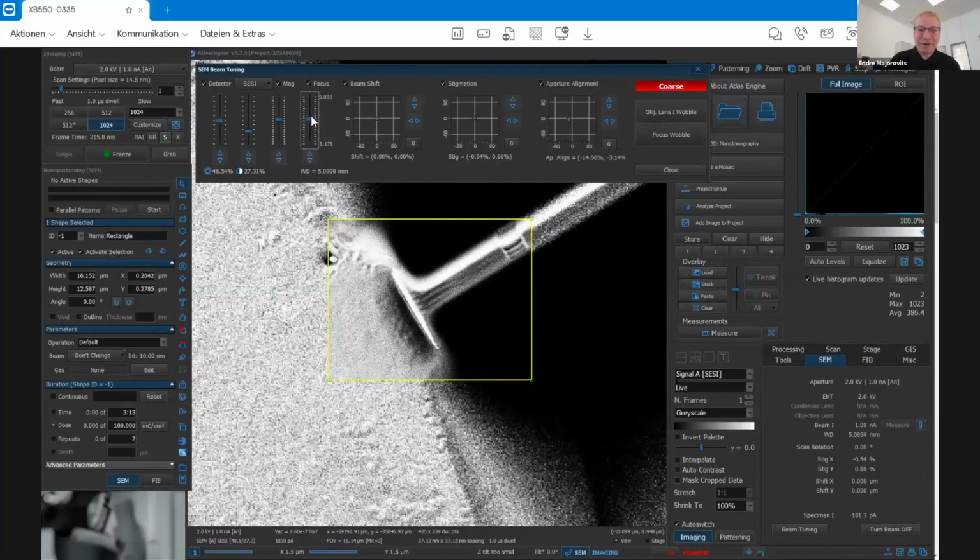And another thing that I haven't mentioned before in SmartSEM, but I will mention it now here. There is a focus wobble. This is used for the aperture alignment. So in case I need to do some alignment here. Okay, so now you see it got worse. So I go a few steps back. Okay, to bring the wobbler to basically pump isotropically. Okay, so I have all the functionalities that I need to align my beam and to get a nice image.